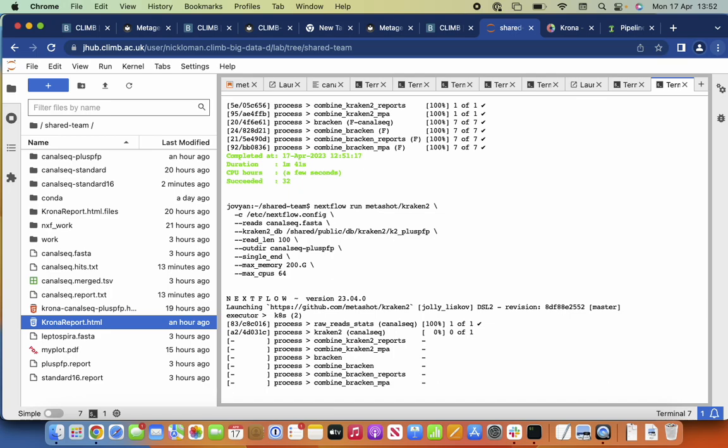So this obviously opens up lots and lots of potential. Now, there are other things we can do here, like, for example, Nextflow understands S3. So if we want to take our files from S3, we don't want to download them into our shared drive. We just give it a reference to S3, and it will understand how to pick those files out. So if our latest sequencing run is in S3 already, we can just point Nextflow at that, and it will deal with the hassle. We can also ask it to put the results back to S3, so you can say the output directory is also in S3. You could even then publish that immediately if it was some kind of pipeline you wanted to run in real time.